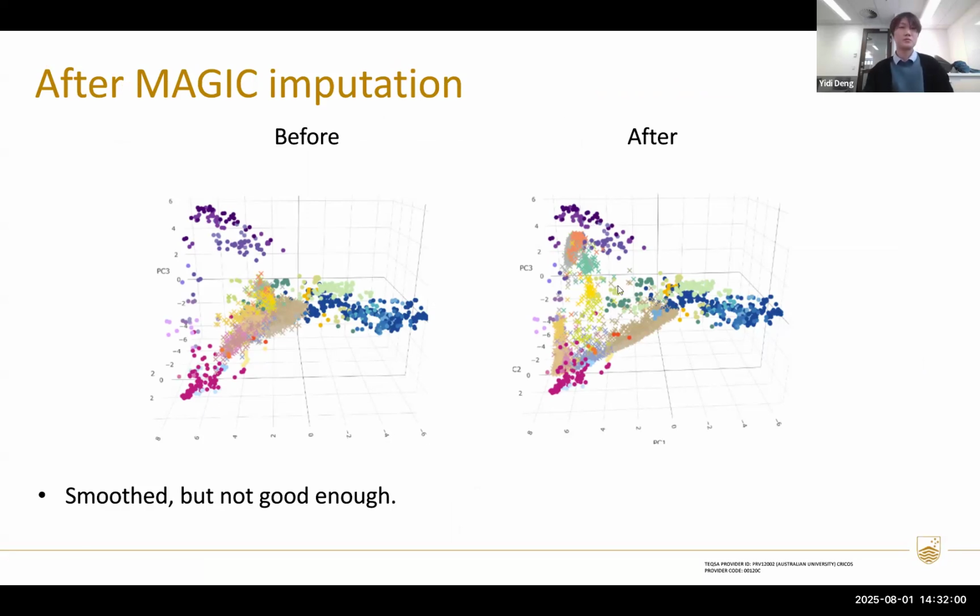How do you assess the beta? Because we know these cells should have a similar cell type and similar cell state, it's informed by whether the clustering looks right. The better coverage, and the separation that you can see.